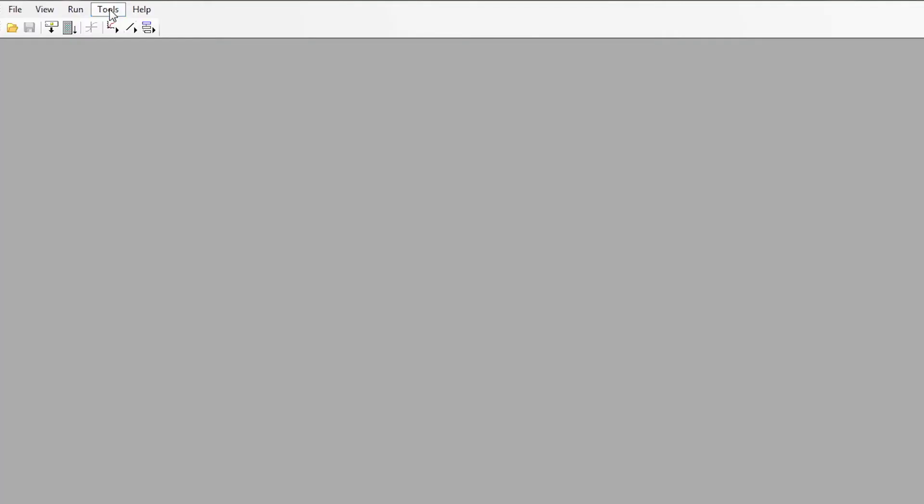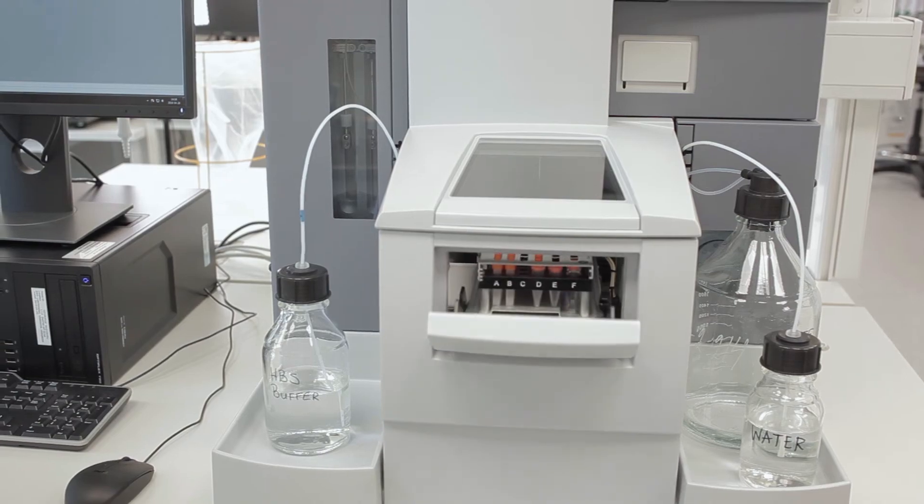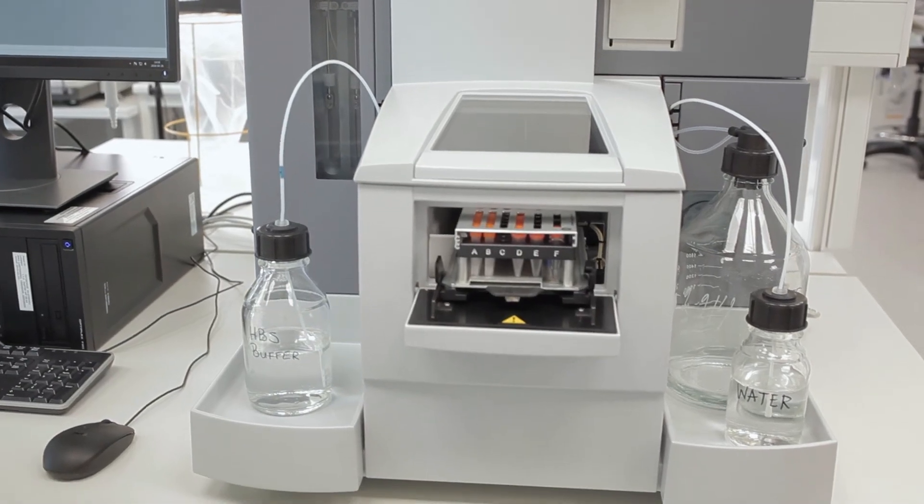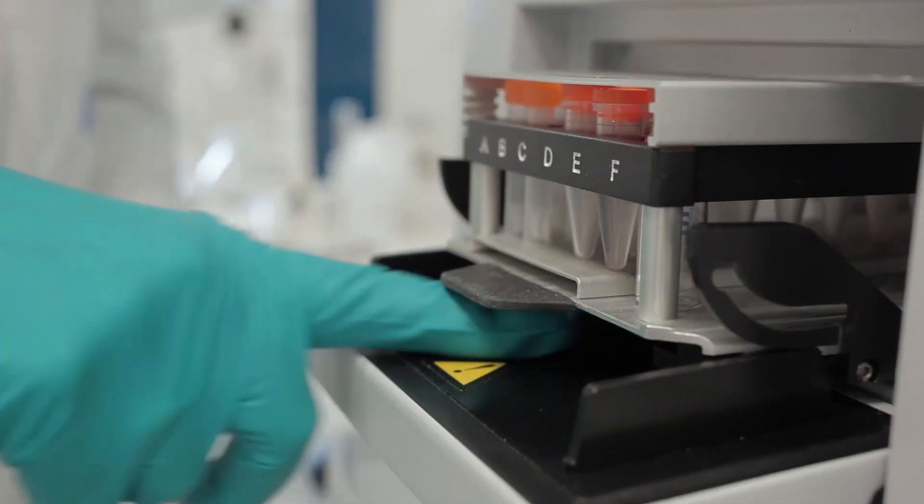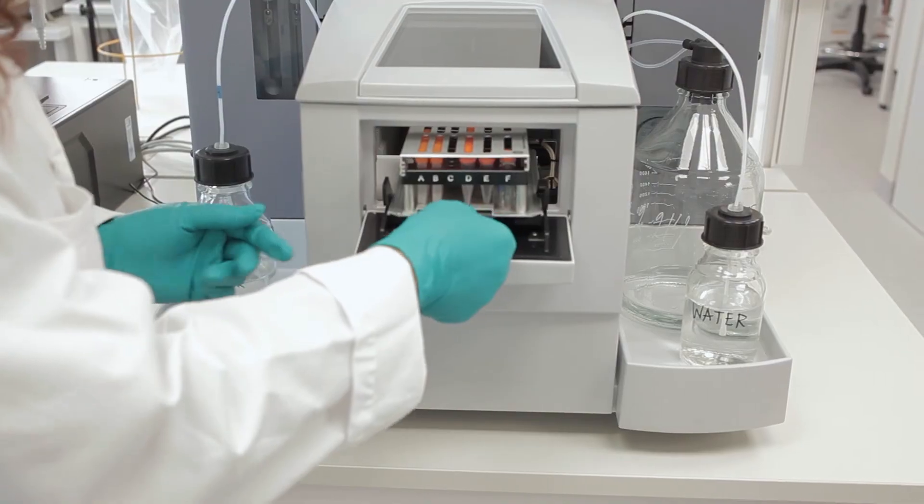The rack is removed by selecting Eject Rack from the Tools menu. Press the button beneath the rack tray to release and remove the rack.